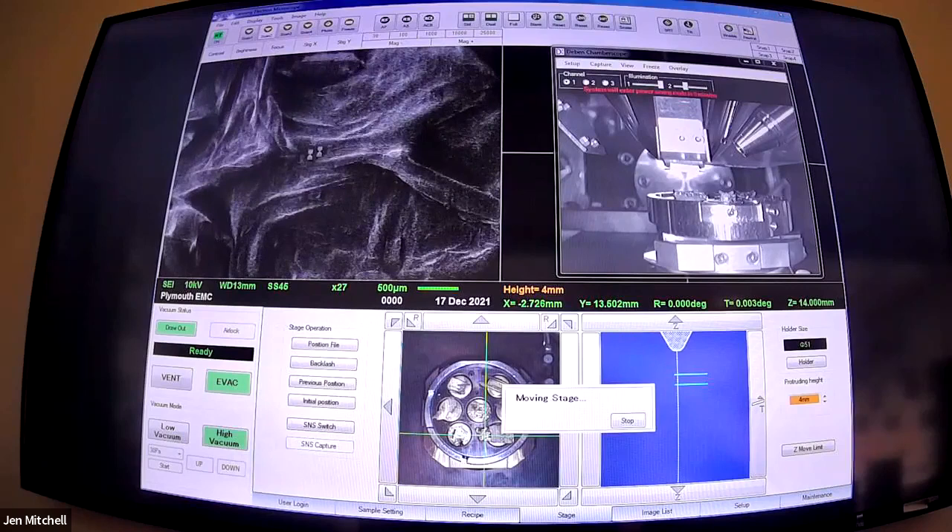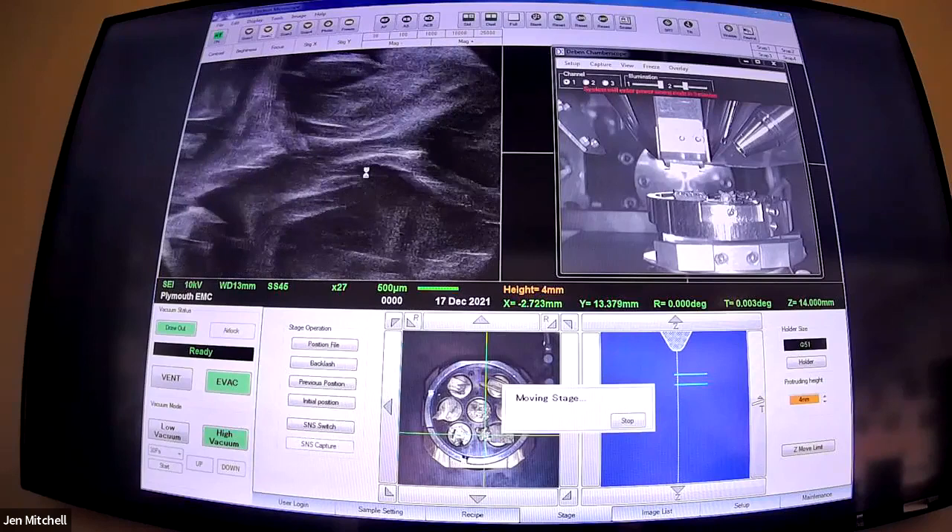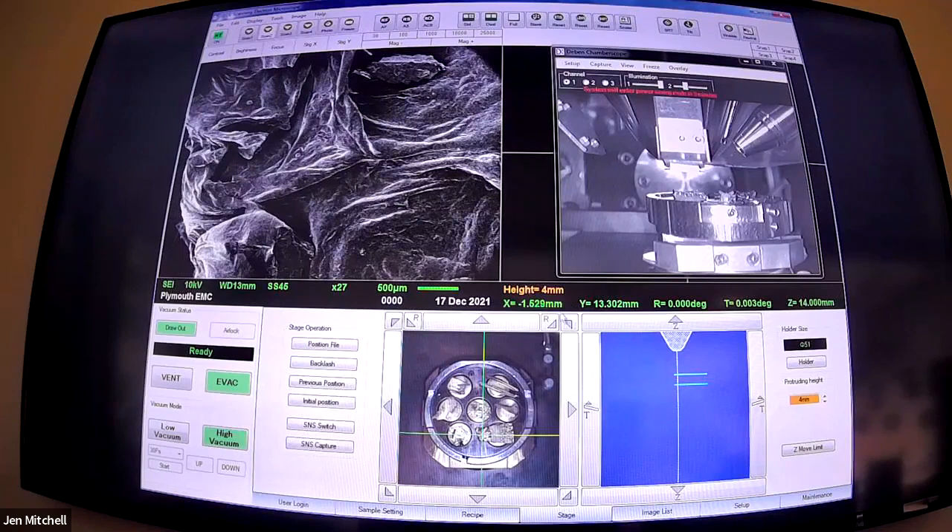The minimum magnification on this microscope is 27 times, which is still pretty large. You're starting to see the edges of the backscatter detector and the edges of the image - that sort of dark shadow around the edge is the edges of our detector, giving a sort of shadowing effect. You'll see that on all the microscopes.